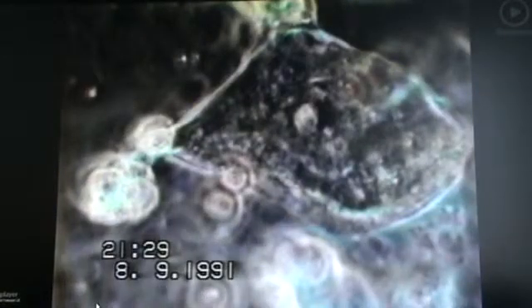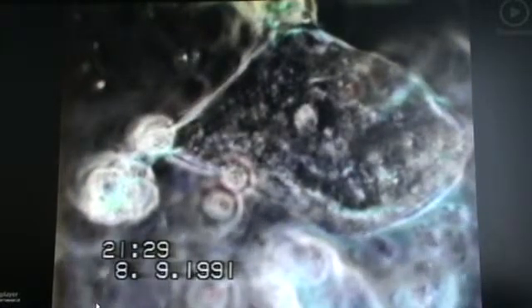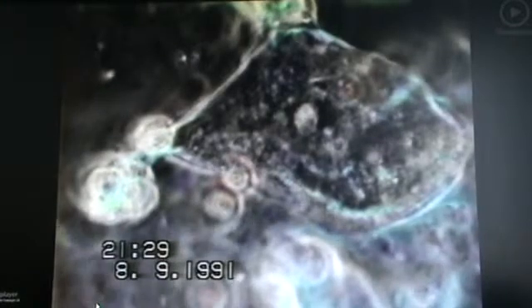Using the Ergonome 500, it becomes possible to enlarge the center of the picture to show the explosive effects of the malignant growth tendency. In the left half of the picture, you can see a tumour attached to the liver cell in the process of division.